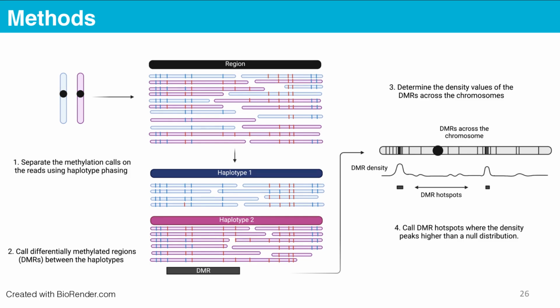And then I can see on a broader view where the DMRs are occurring and if there's any sort of major clustering of DMRs across the chromosomes. So in this schematic of a chromosome, the black lines are DMRs, and I'm trying to show little loci that have particularly high densities of DMRs, and you can map the DMR density accordingly below it.